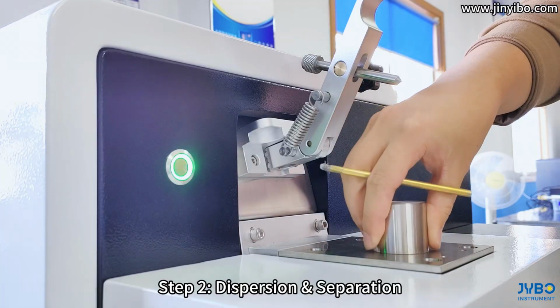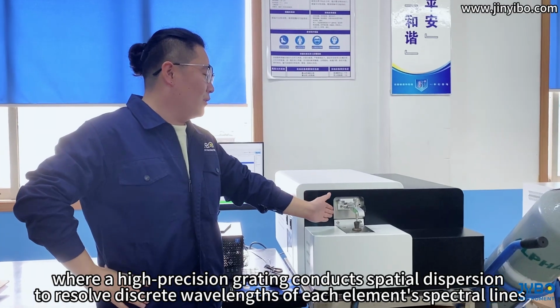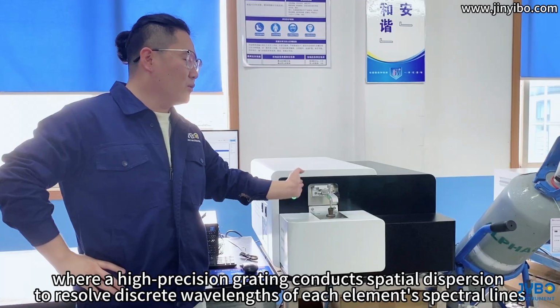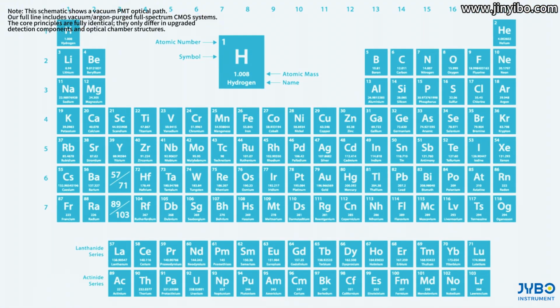Step 2. Dispersion and separation. The composite light beam enters a sealed, vacuum, or argon-purged optical bench, where a high-precision grating conducts spatial dispersion to resolve discrete wavelengths of each element's spectral lines.